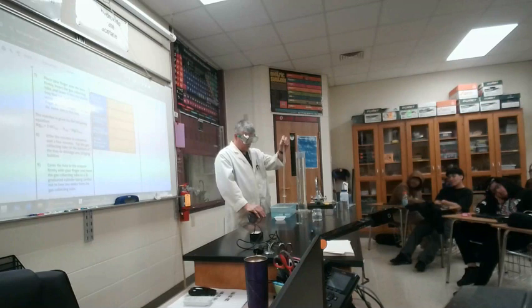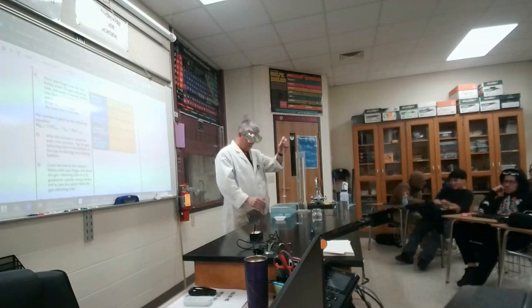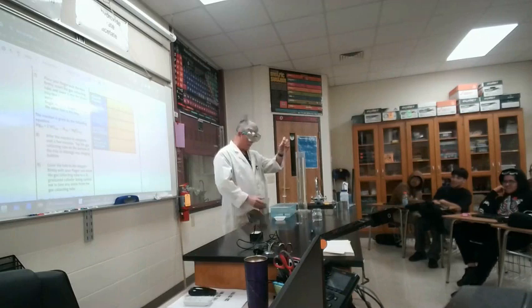Okay, you're going to bring me your magnesium ribbon and I'm going to cut it to make it smaller. Otherwise, what just happened to me will be happening to you. There's nothing left in the tube. There's supposed to be some liquid left in the tube. I can't measure it. Too much gas was created.